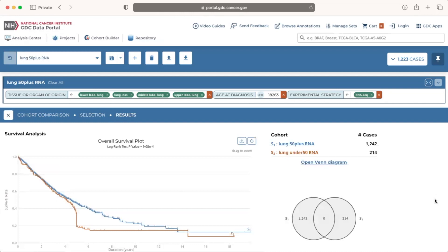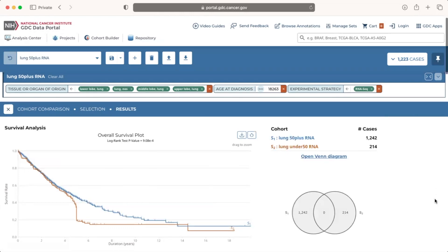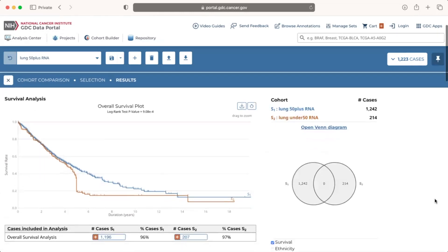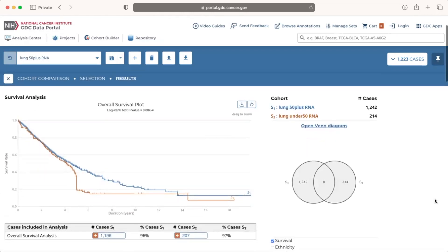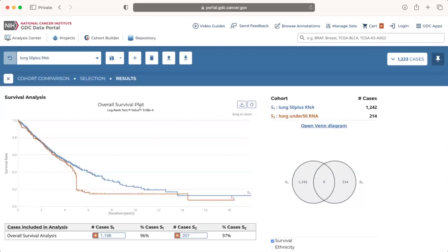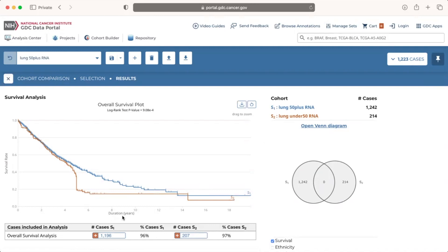When the Cohort Comparison Tool is run, several visualizations are automatically populated with data from the two cohorts. A plot for overall survival appears on the left side of the screen, displaying Cohort 1 S1 in blue and Cohort 2 S2 in orange. The plot presents duration in years along the x-axis and survival rate along the y-axis, as well as the log rank test p-value below the title.